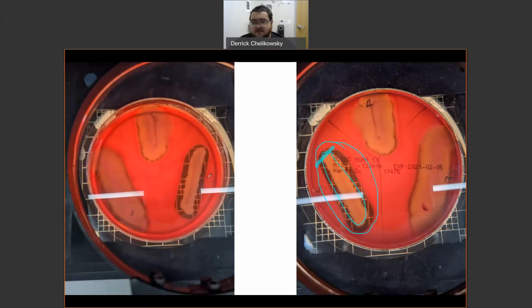Keep in mind that this is after 24 hours of incubation, and for some of these, they don't work perfectly. We can see that here with Staphylococcus aureus, we have on this side mostly, 3 zones. You have your bacteria right here. You have your second zone right here, which is actually alpha, or green hemolysis. You can see the green easier on the other side. It's this area right here, that sort of dull green. That's what we're looking for when we're looking for alpha hemolysis. And then you have this very thin area around the edge that is fully cleared, which is complete or beta hemolysis.